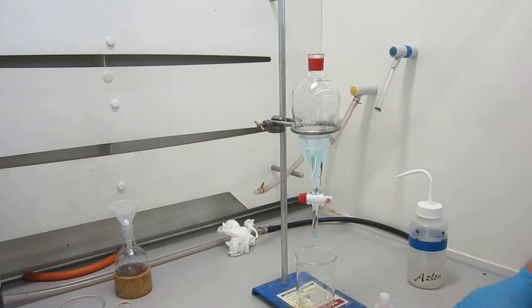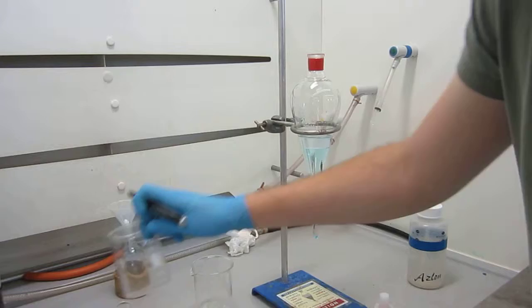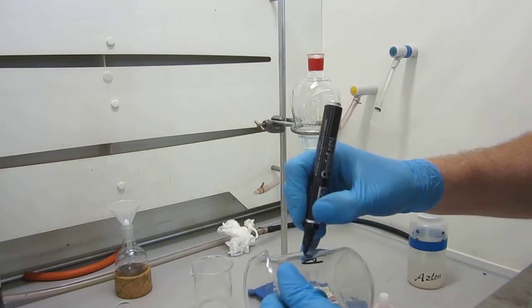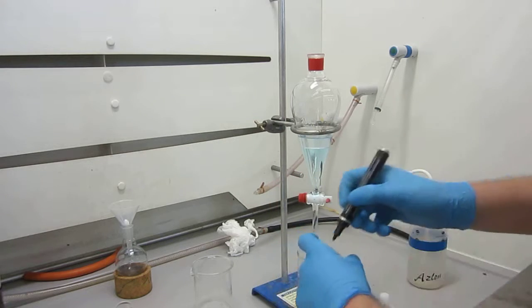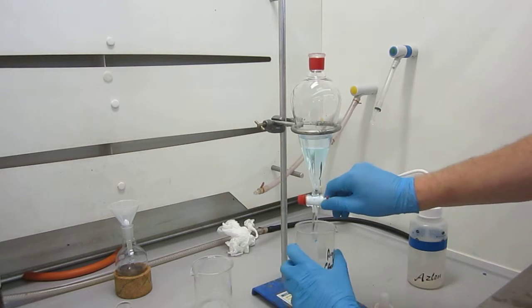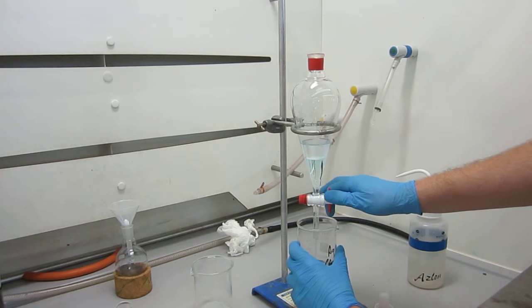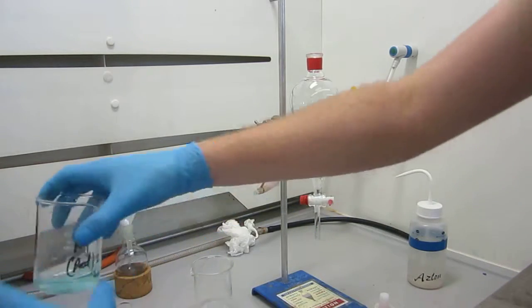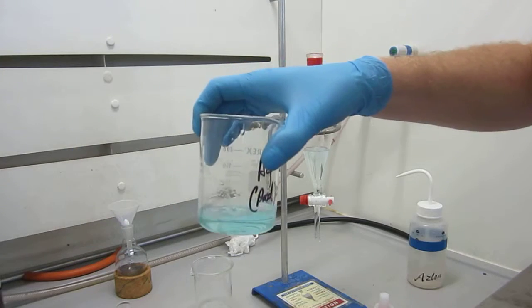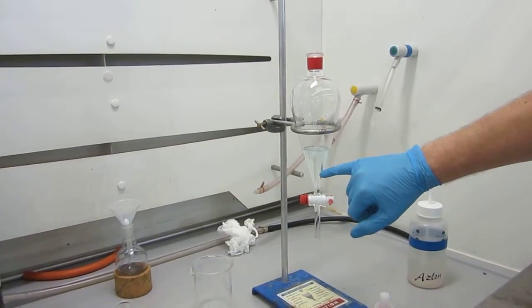So that's separated out quite nicely. So I'm going to collect this into a different beaker just because I'm going to do aqueous product 2. I'm going to collect this into here now, making sure the bung is out, otherwise it won't come through. There we go. You can see it's a little bit paler blue, but we're still getting product out. And the ethyl acetate layer has lost a bit more of its colouring.